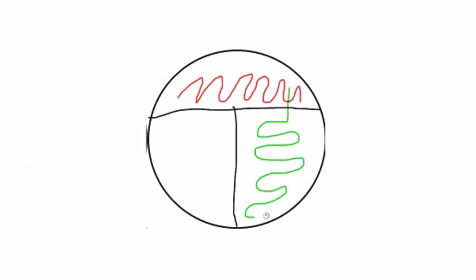For our last zone, we will drag a slight bit of bacteria from our second zone and again spread it out, stopping before we touch our first zone. Each of these colors is indicative of a sterile inoculating loop, and we have spread bacteria out, starting from a more concentrated region up here and then diluting it out until we get over to here.